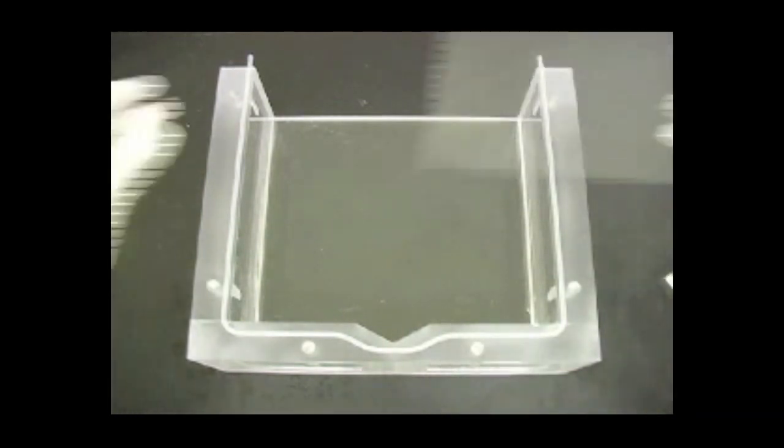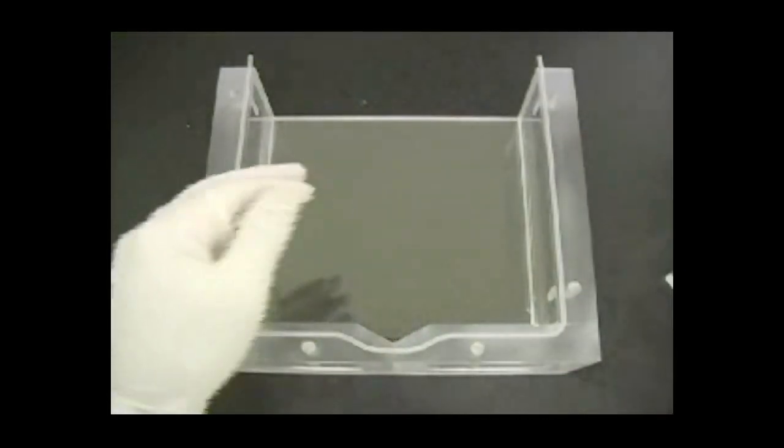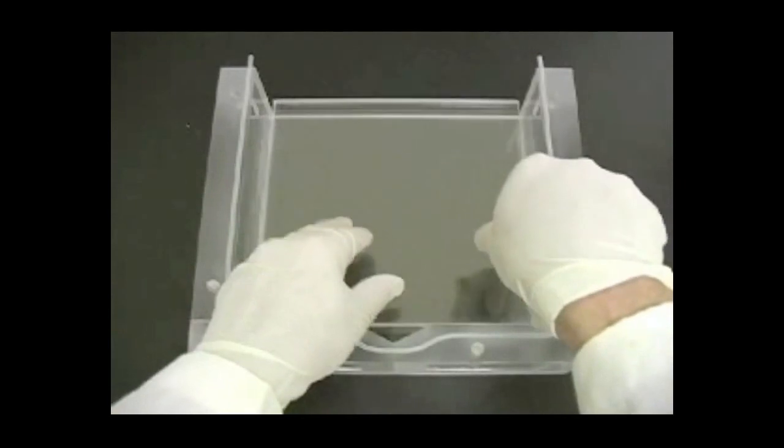If you are casting less than 12 gels, use acrylic blocks to fill the space in the chamber. We will be casting 4 gels here.